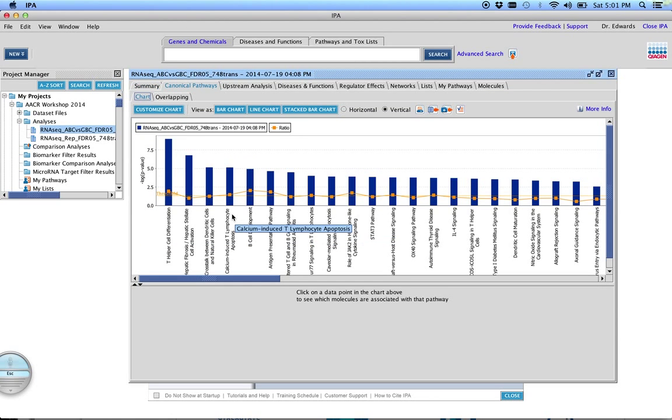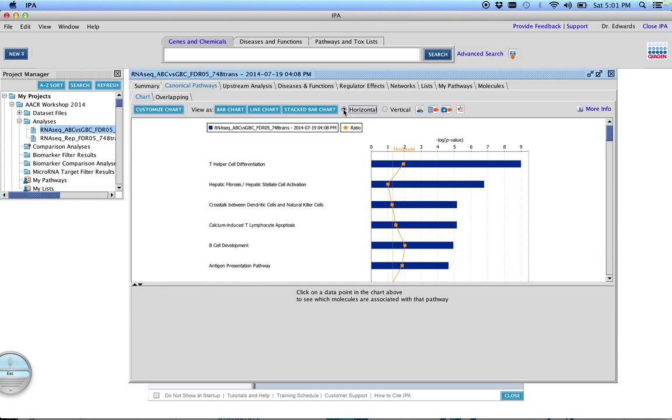Given here, listed by the odds of it, I'm going to make this a little easier to see. Given here are pathways with members overrepresented in our gene list, and this is sorted statistically. So the less likely you would see all these genes in these gene lists, the higher up on the list. Given on this scale here is the negative log p-value. The higher this number, the more significant the result of this pathway being in our analysis.